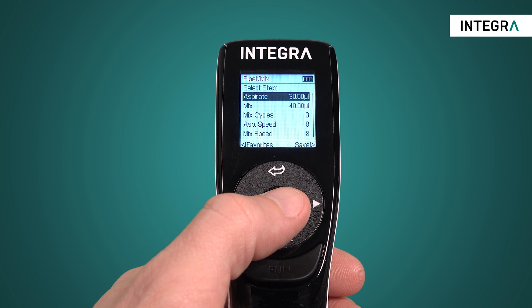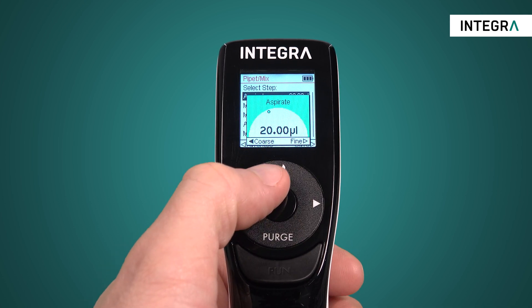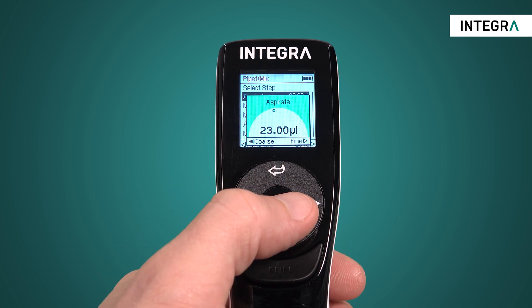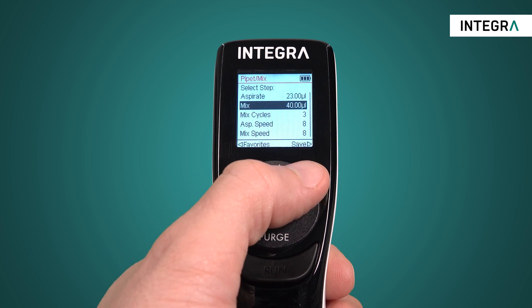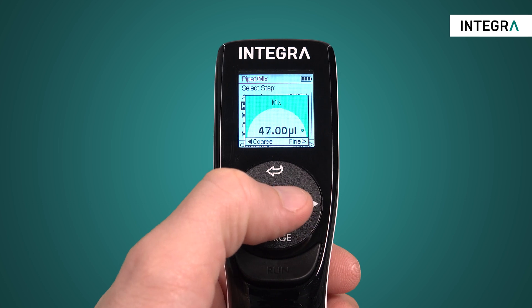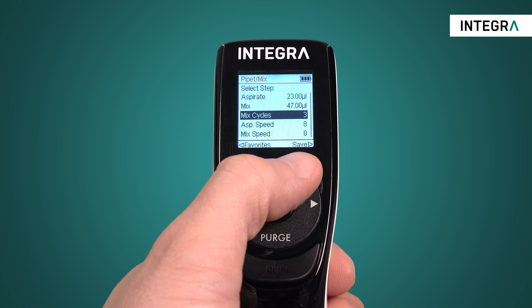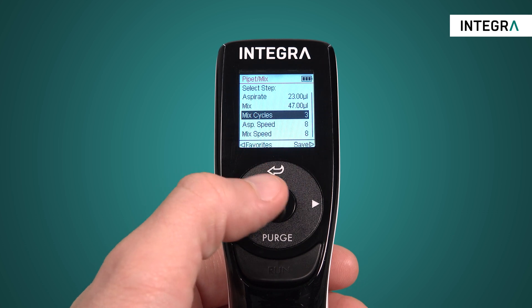You'll set an aspiration volume — essentially this is the liquid which you'll aspirate and needs to be mixed together with a second liquid. The setting mix is the exact volume which should be mixed. Typically you want to mix enough so that the two liquids are completely blended, but not so much that air enters your tips.